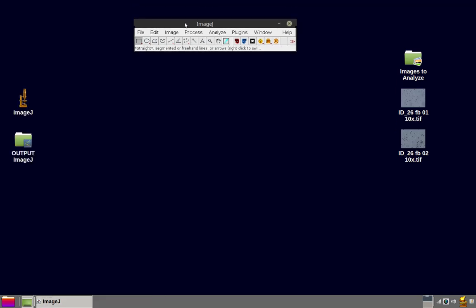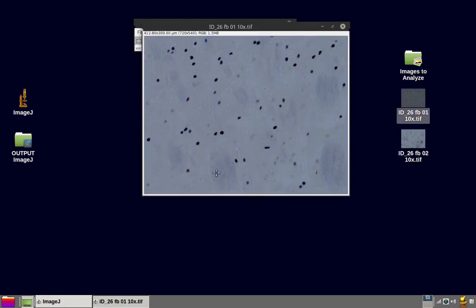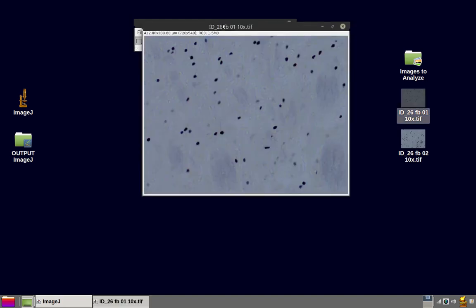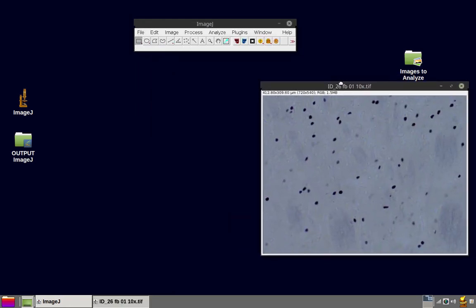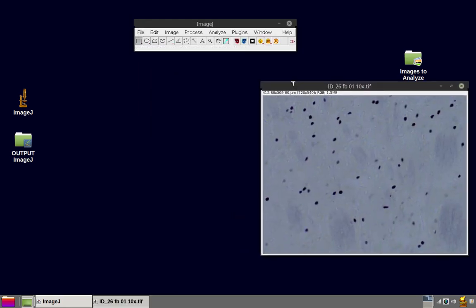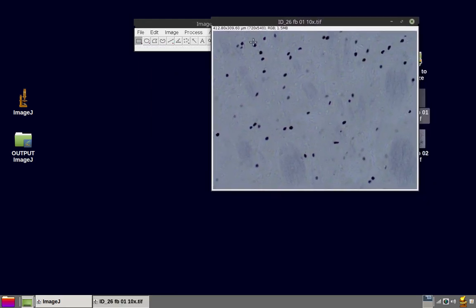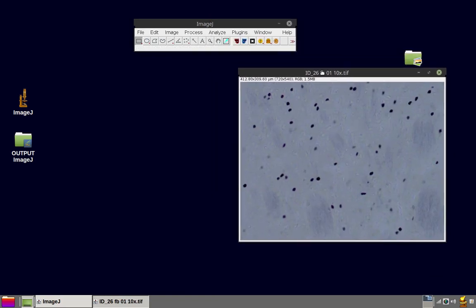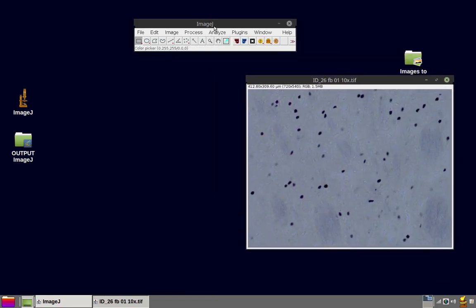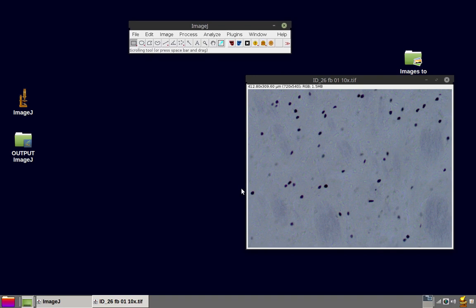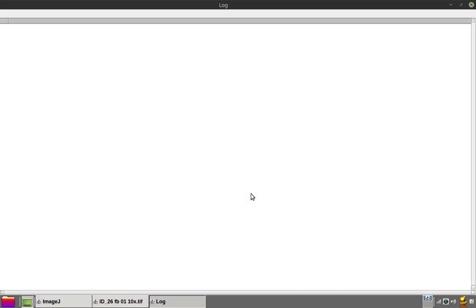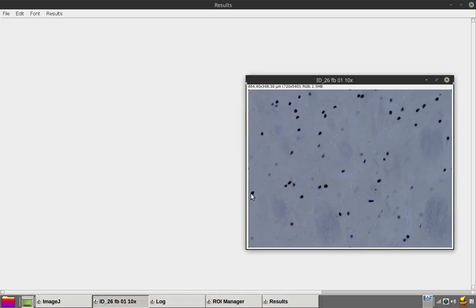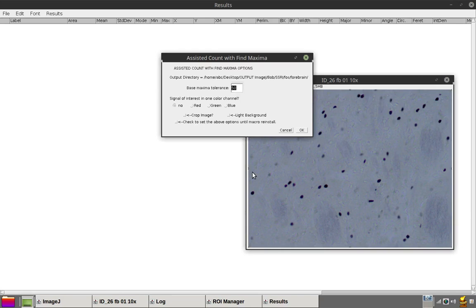Drag and drop the first image for analysis onto the ImageJ main window. Press keyboard shortcut F4.